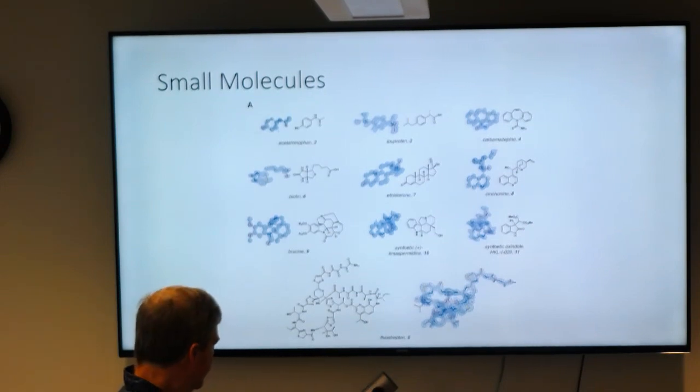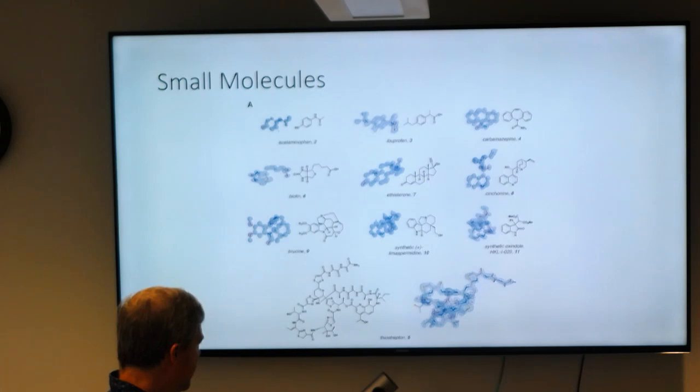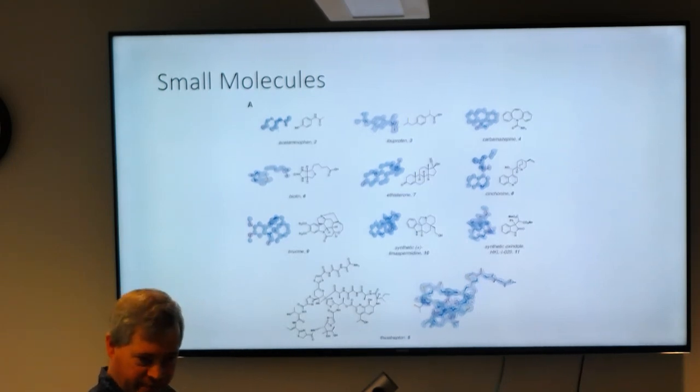And we're trying to get it going at NYSBC. We don't have a full workflow yet, but we will soon. We're trying to work it into Leginon. But we did the same sort of thing with caffeine. We just ground up a pill and dipped a grid in it, and a lot of the little things stuck to it.